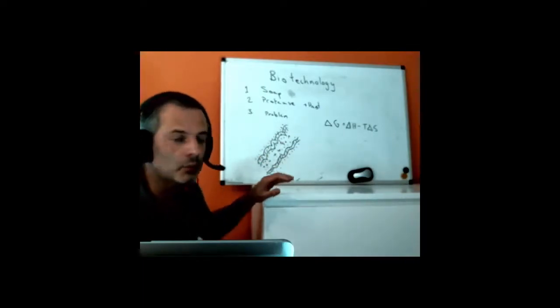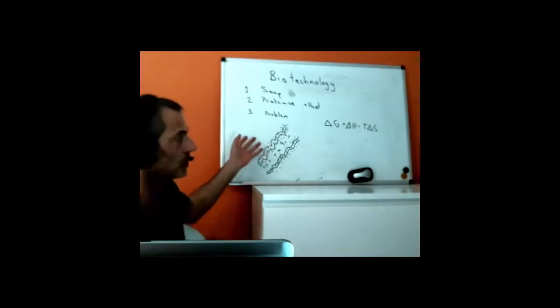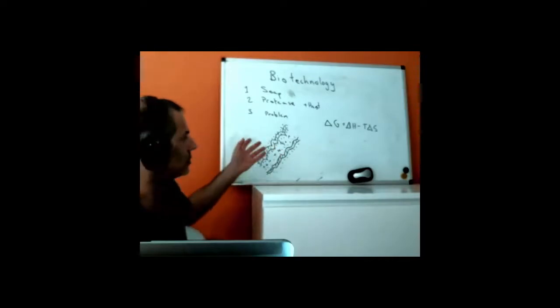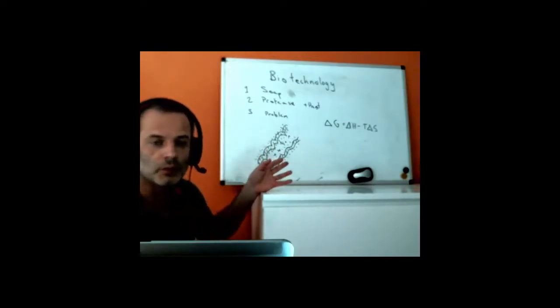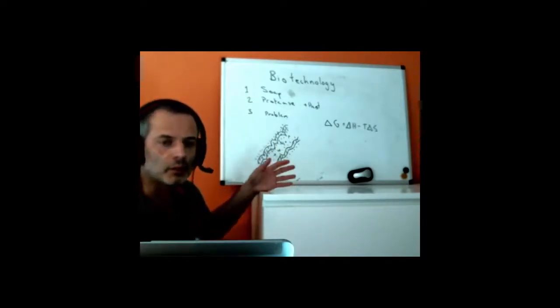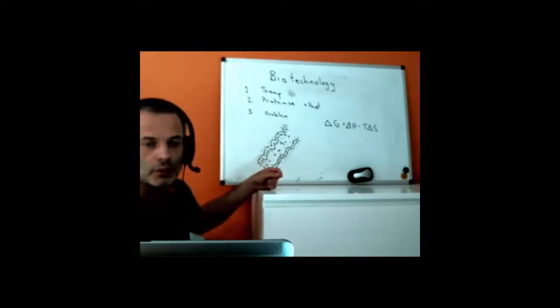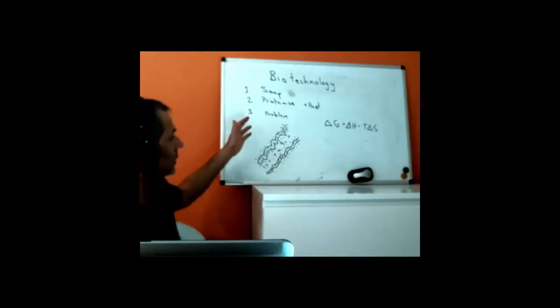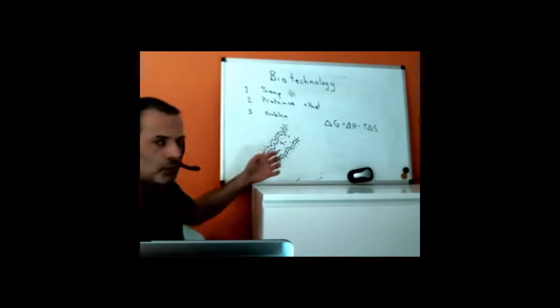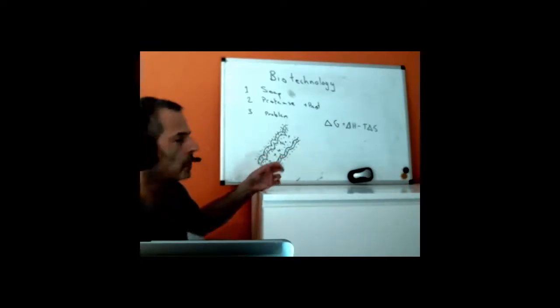So what can we add to make water less polar? It has to be something that will mix with the water perfectly, because obviously if we throw some oil in, it'll just hang around on the top. And it has to be less polar than water. A good example for that would be ethanol. So ethanol is a solvent that's less polar than water. Salt won't dissolve in it very well, and it will mix with the water and make it in general less polar, so the total solvent polarity will go down.